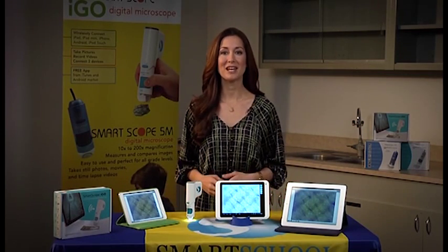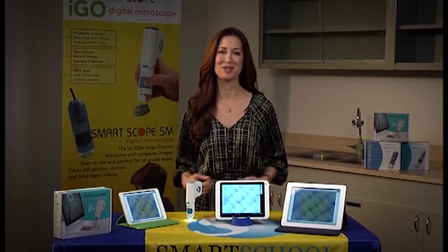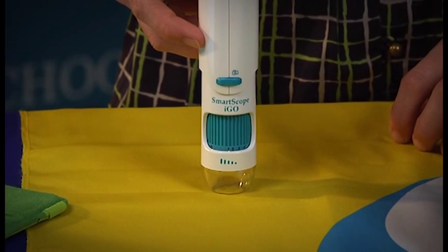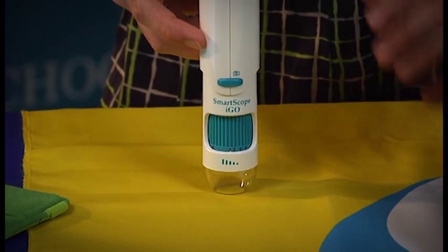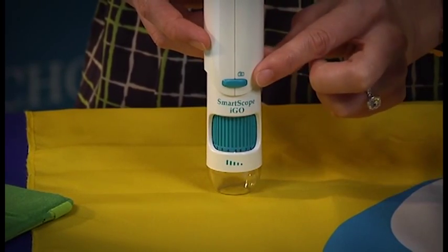For instance, right now I'm connected to an iPad Mini, an Android tablet, and an iPad. Now let me show you how it works. Like all SmartScopes, the SmartScope iGo is very easy to use. On the front, you have your focus dial and your snapshot button.